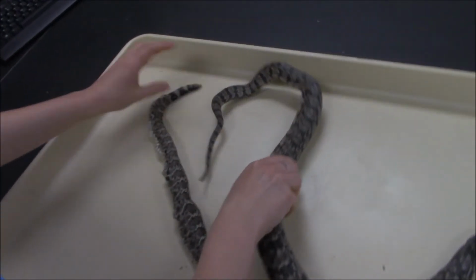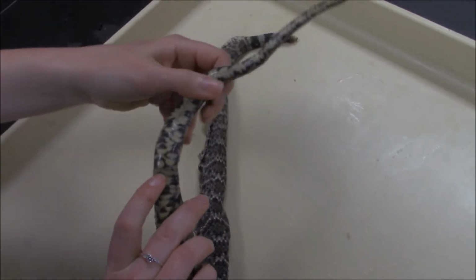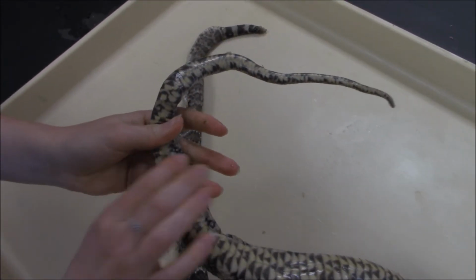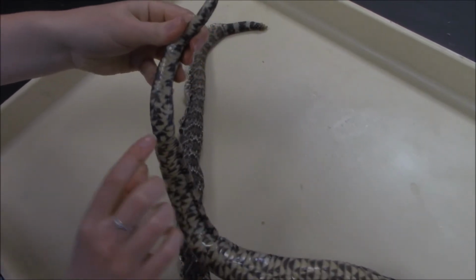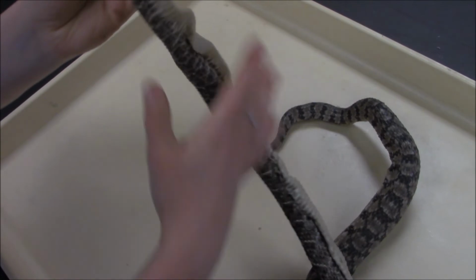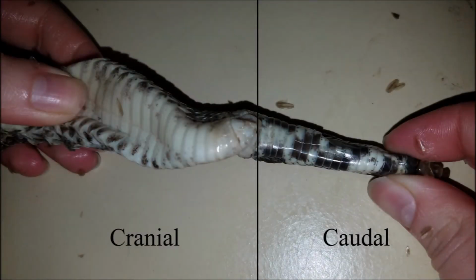As you can see on our colubrid, we have the anal plate, which is where the cloaca is, and the belly scales. Before the anal plate, it is a single scale. However, afterwards, it becomes two scales. As you can see, cranially, it's a single scale, caudally, it's two. On our venomous snake, we have the anal plate, while we have a single scale, both cranial and caudal to the anal plate.